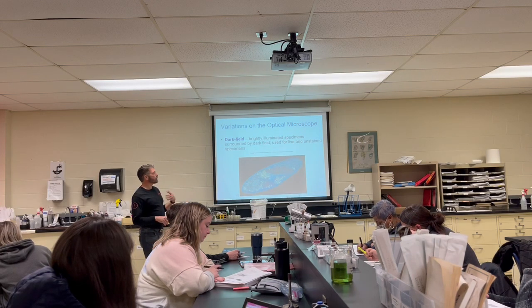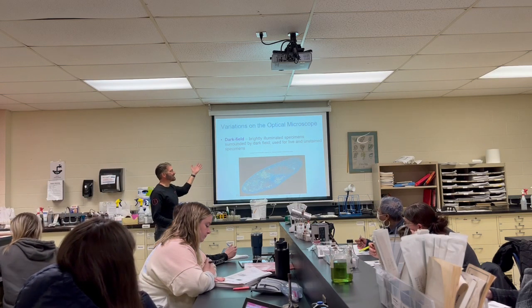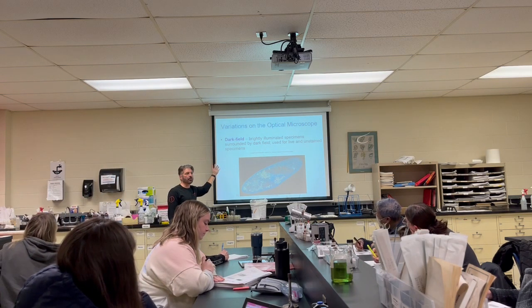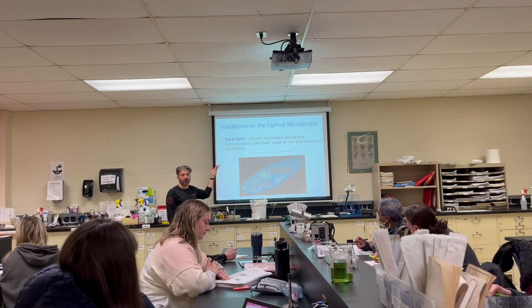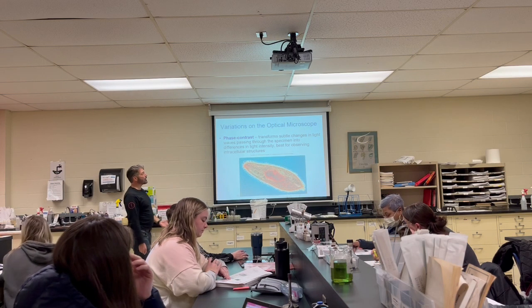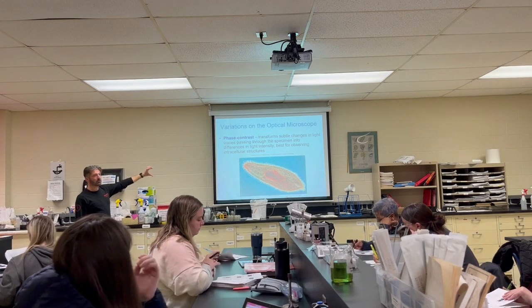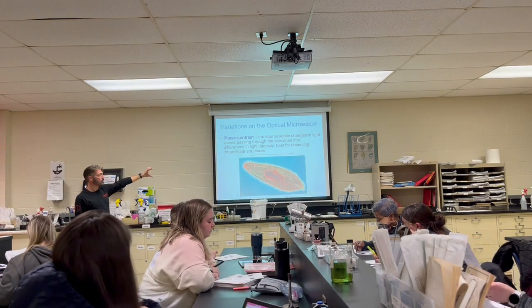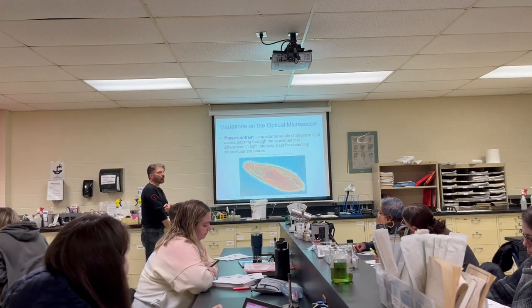So dark field, don't worry about this, I won't test you on it, but you have seen this in case it pops up on the exam after you leave here on one of your NCLEX or MCAT exams or whatever they ask you. Right. Phase contrast, if you look, that gives you a much better 3D picture of what's going on in there. Right. And last week I said, if you look at bacteria, what don't they have?